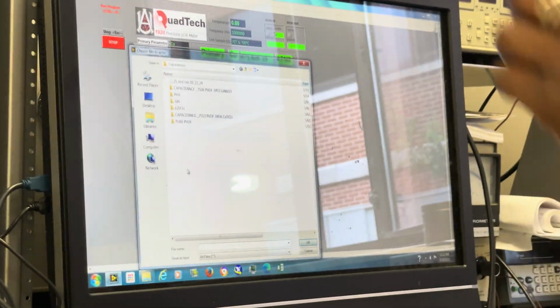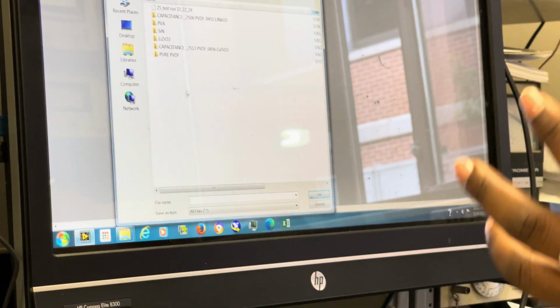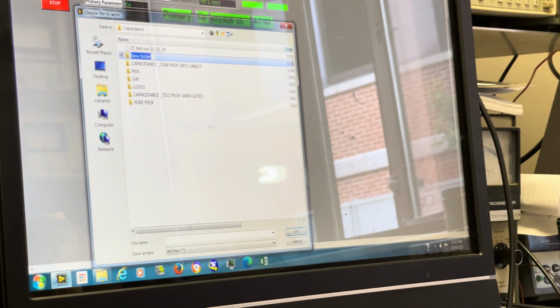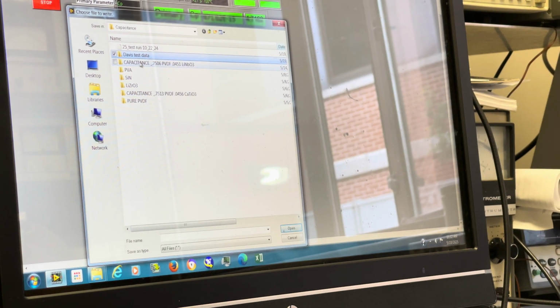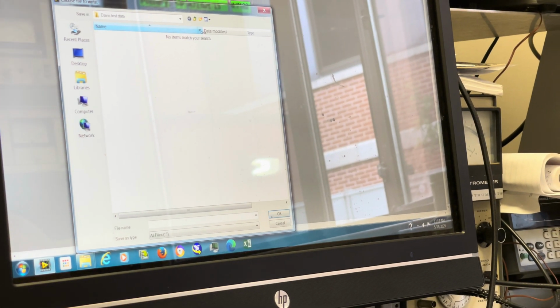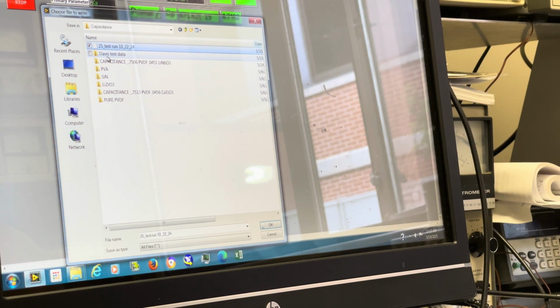Let's go ahead and just be proactive while you're waiting on your temperature to increase. And you can do this at the very, very beginning. Go ahead and create your new folder. So I'm just going to put Davis Test. So I've created my new folder, and then in addition to creating my new folder, let me grab this name. We're just going to use that same name.